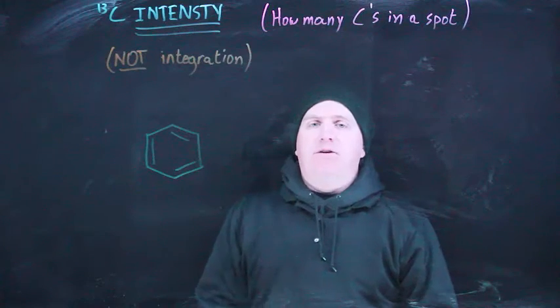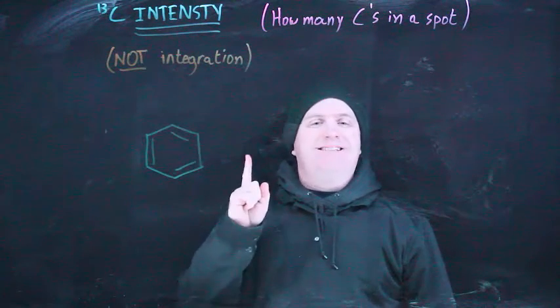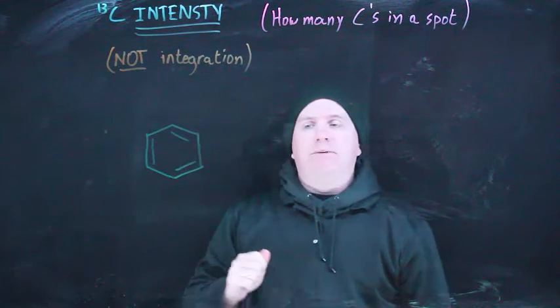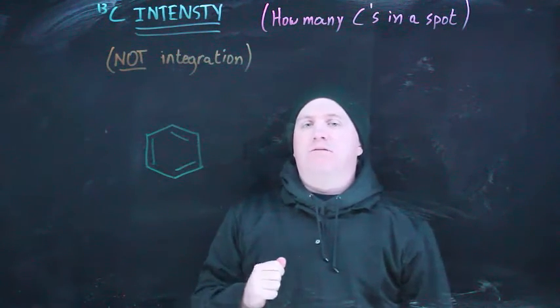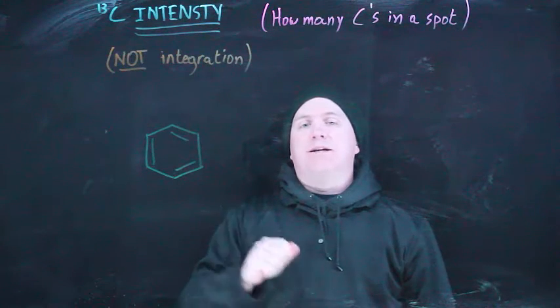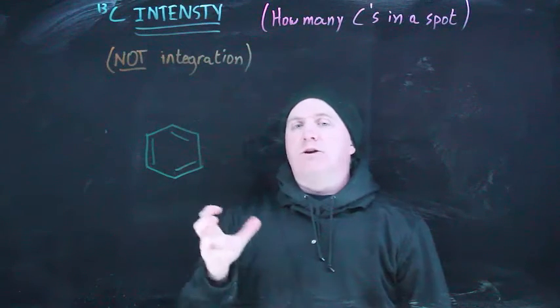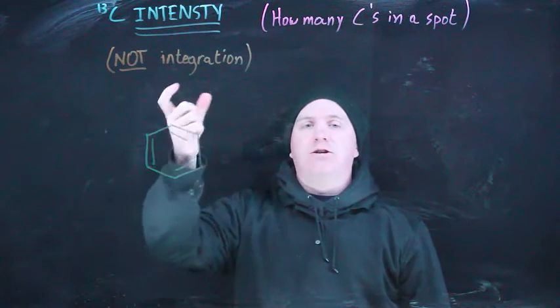The topic of this video is C13 NMR intensity, and I pointedly did not say integration, and that is because if you've watched the C13 multiplicity video, we do things in collecting the spectra that make it impossible to integrate well. We're altering the spectra in ways that make integration untrustworthy.